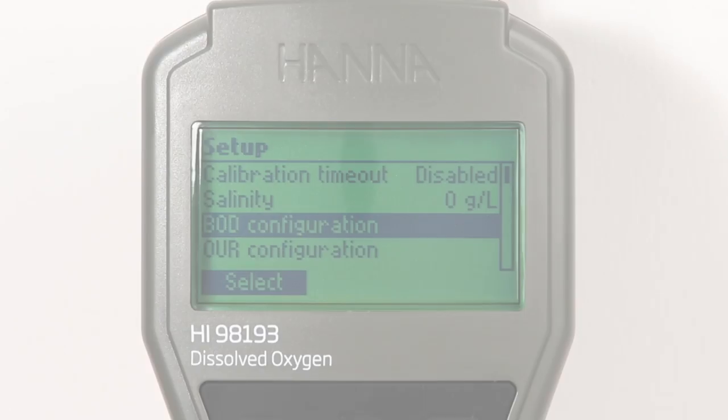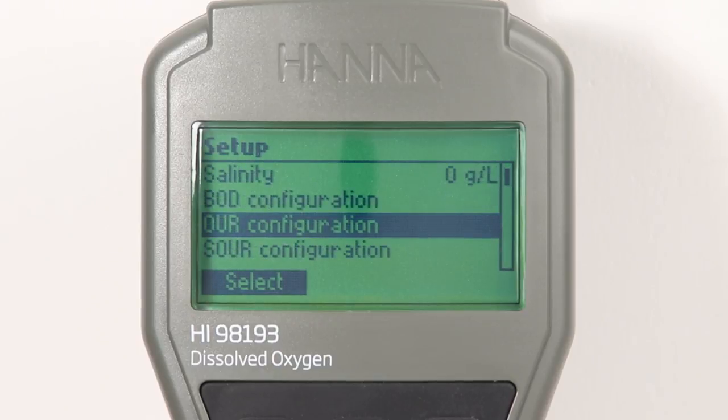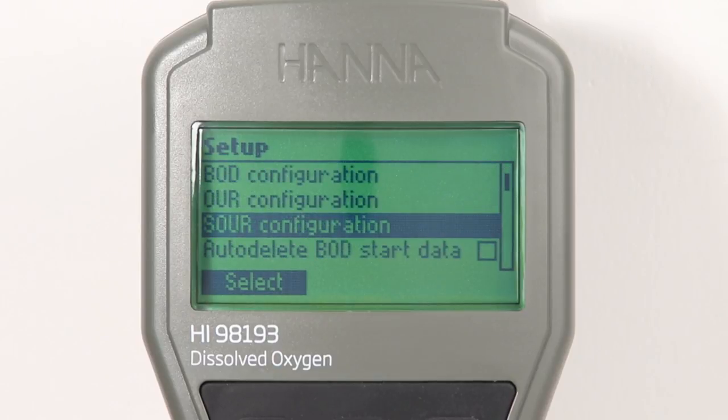Measurement options such as the setup parameters for performing a BOD, OUR, or SOUR test can be fully customized through the setup menu.